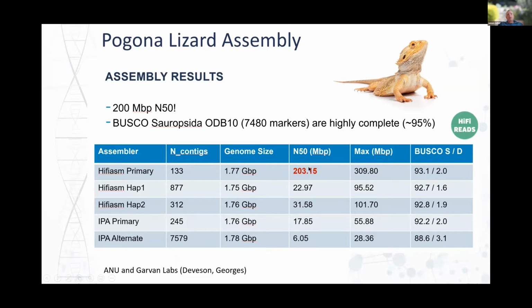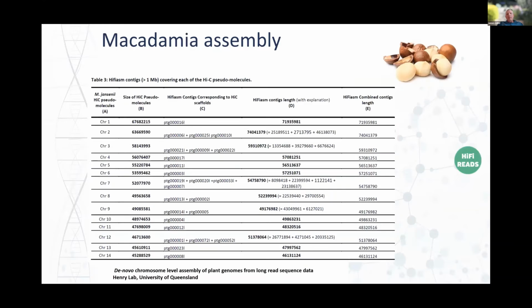They've actually looked at one of the contigs, and it had all of these low complexity regions at both ends of the contig and in the middle. You look at it and you go, well, that's just one whole chromosome completely assembled. So I think we're at the point now where PacBio can say we can virtually completely assemble genomes with just HiFi reads, with some caveats for some really low complexity regions where you need to do some manual curation.